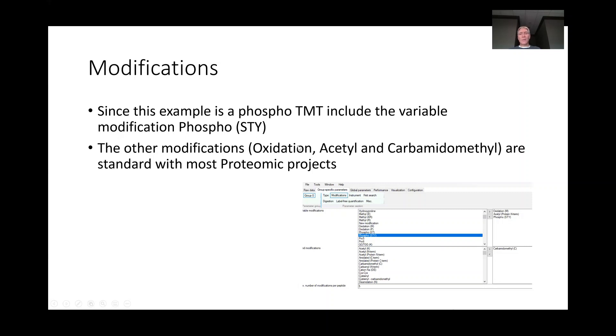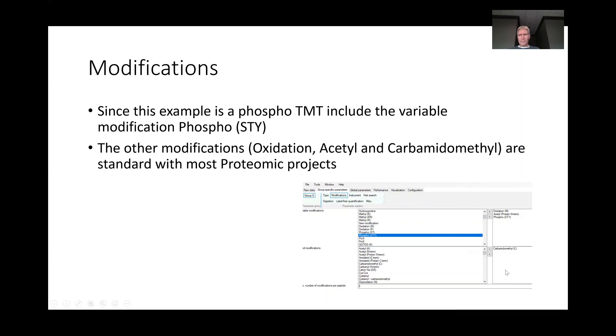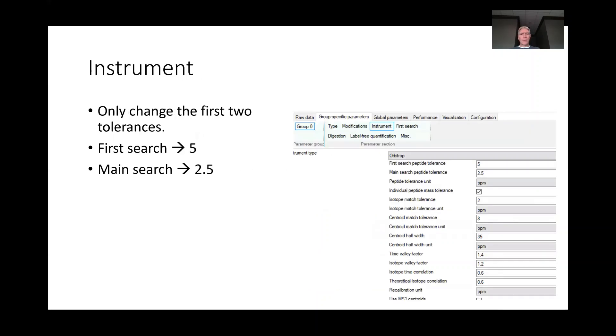Other modifications which are included are the oxidation and the acetylation of the N-terminus as variable modifications, and the fixed modification here is that carbamidomethyl group that we put on the end of the cysteine residue.